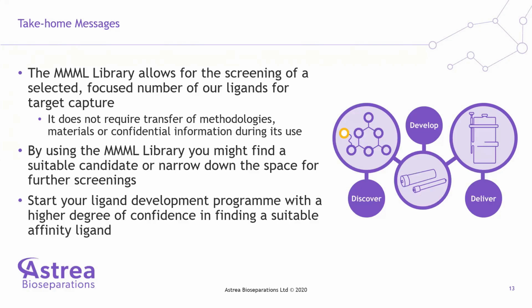By using the MMM plate, you might find a suitable candidate, but you should at least narrow down the chemical space for additional screenings. And the good thing about this is that you can start your ligand development program with a much higher degree of confidence that you are going to find a suitable ligand.